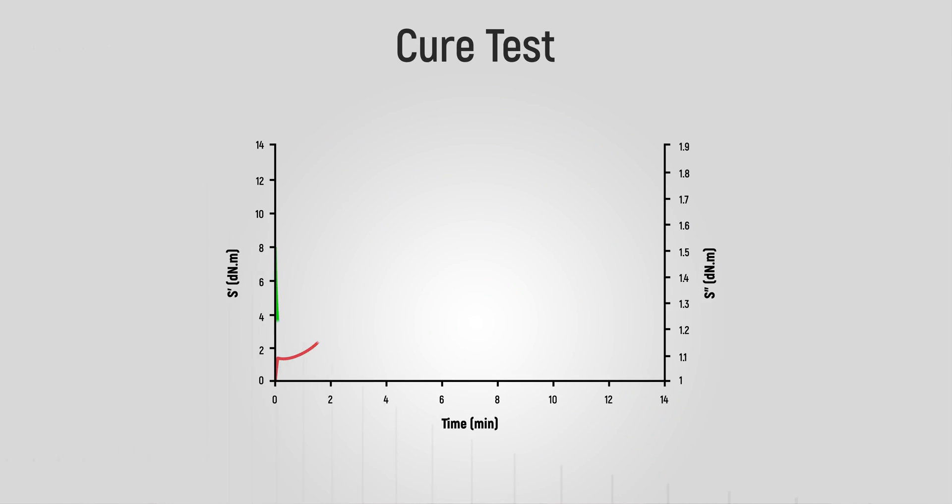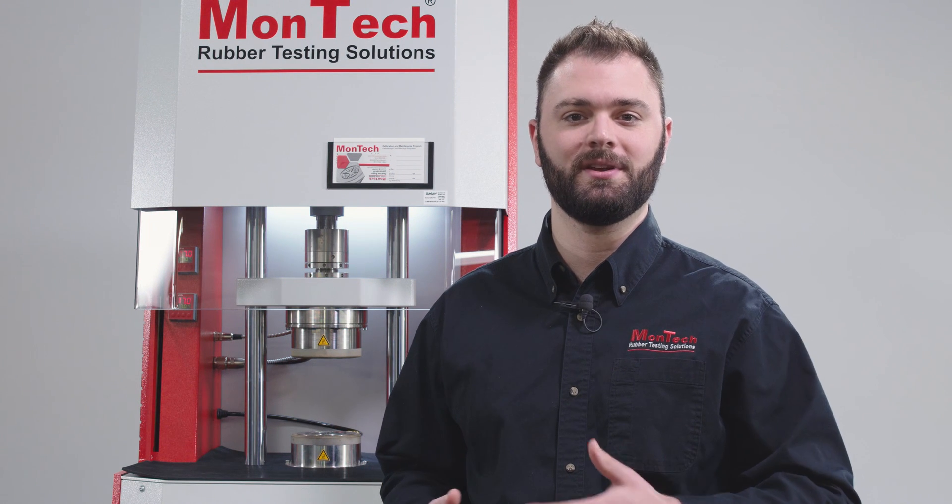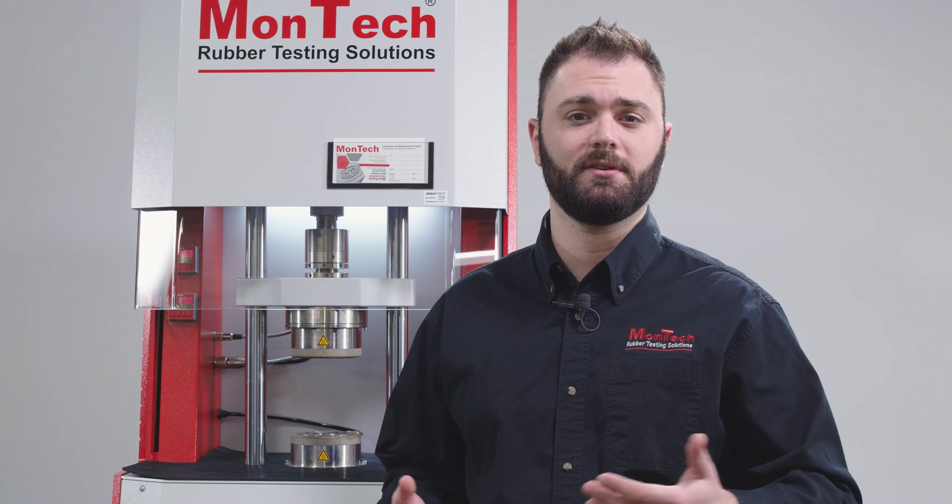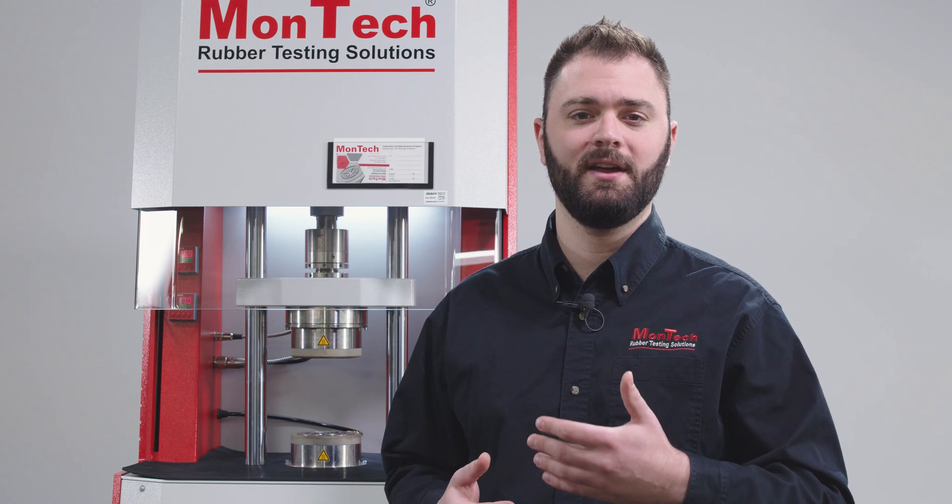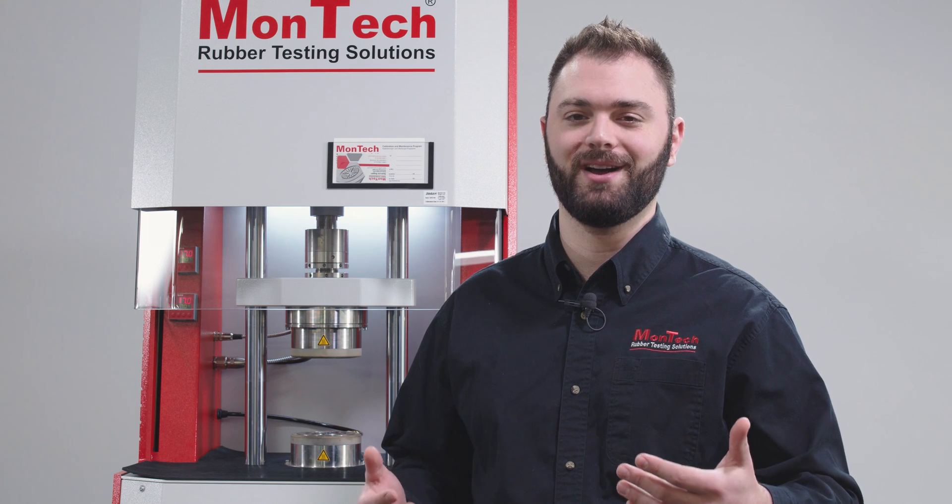By examining the data from the test results, it can be determined when a material begins curing, or its scorch time, as well as how long it takes the material to fully cure at the temperature used for the test, or its cure time. Predictions about the material's cured durometer hardness can be made from S' max and can be useful in determining appropriate filler loading. TC times indicate the rate of cross-link formation at various stages of the reaction and can be useful in determining appropriate quantities of chemicals used to speed, slow, or otherwise control the curing process.